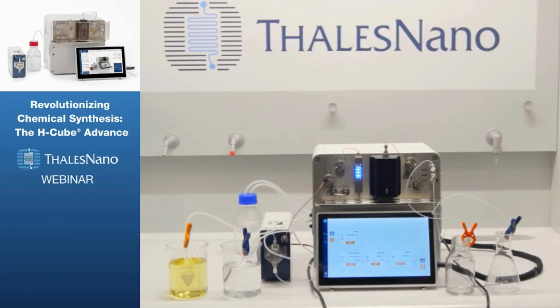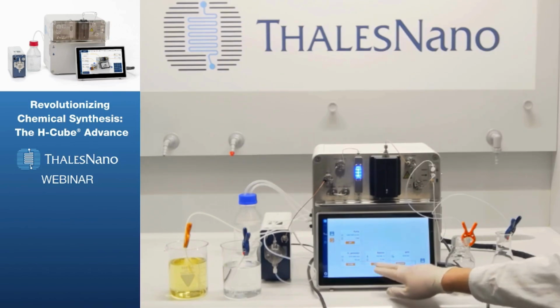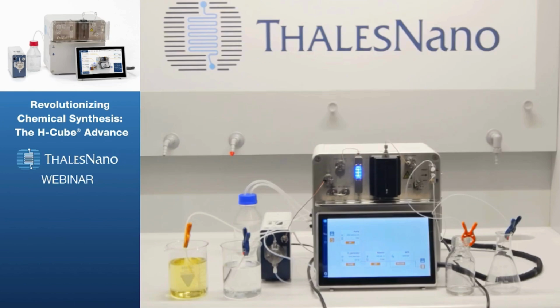So in about 5 minutes, I will be able to stop the experiment by releasing the pressure and the temperature. That can happen pretty much at the same time. Maybe it's advisable to start the cooling first in order to avoid the overboiling of the solvent. So if you want to be extra careful, you stop the heating first and then release the pressure to avoid instantaneous evaporation. And after both of those parameters have reached atmospheric and room temperature conditions, you can stop the injection of gas and liquids, and that's basically the end of the experiment.